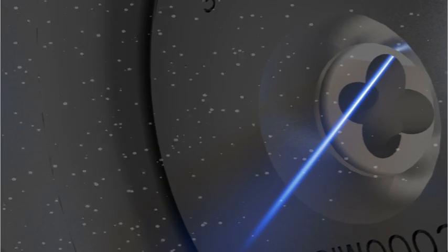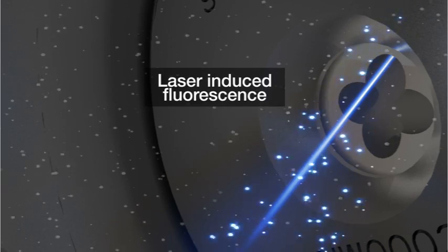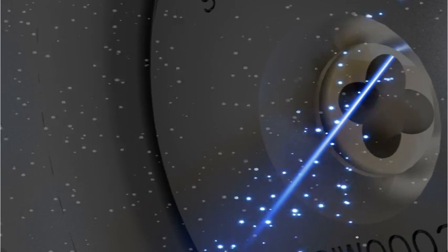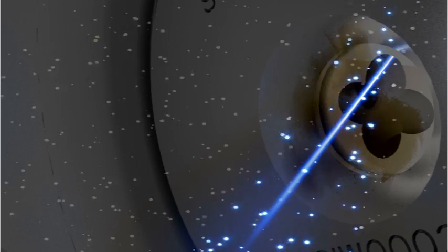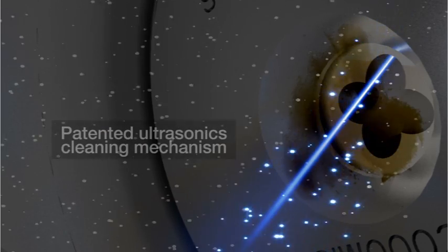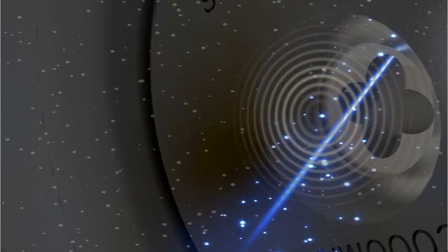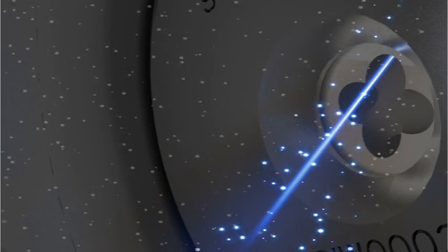During the measurement cycle, a laser directed into the chamber excites the oil and the fluorescence induced is measured. Periodically, at user configurable intervals, the patented ultrasonics cleaning mechanism cleans the sensor's head of any oil or fouling.